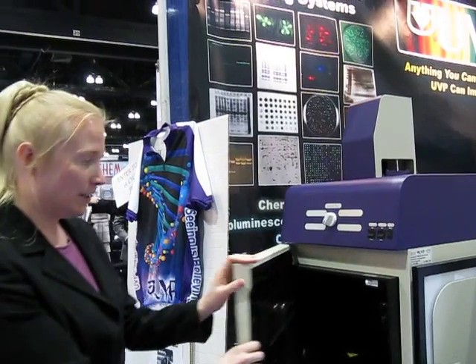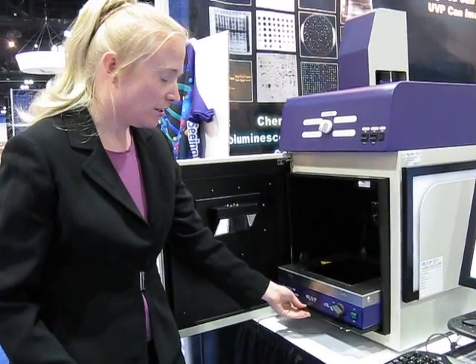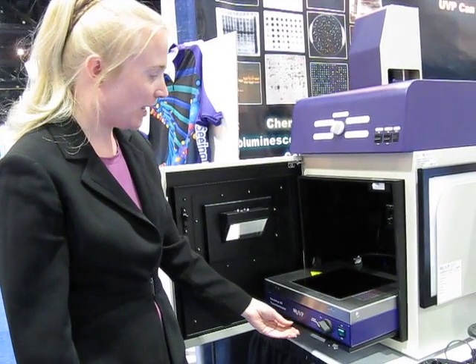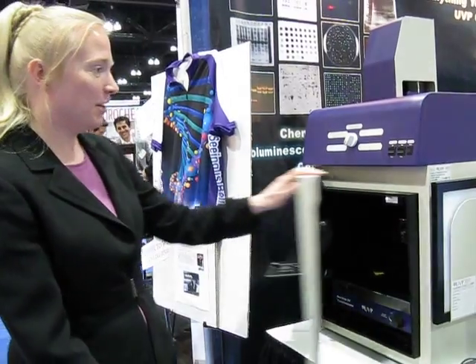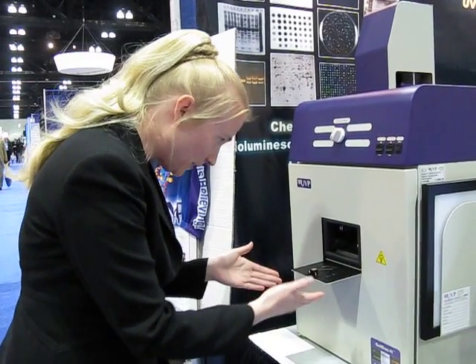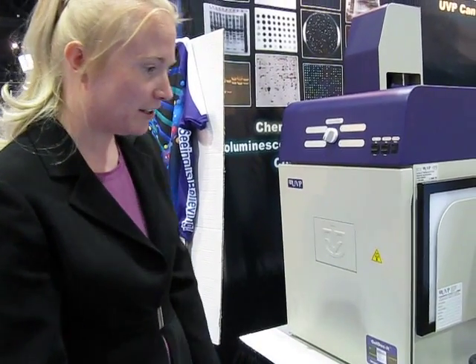You open up the darkroom door and slide out your tray. You put your gel right here on the transilluminator. After you do that, push it back in and shut the door. You can actually open the window here to see your placement of the gel. Make sure that it's fluorescing the way you want it, then go ahead and close that door when you're finished positioning the gel.